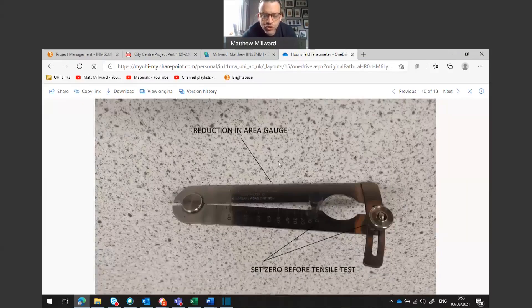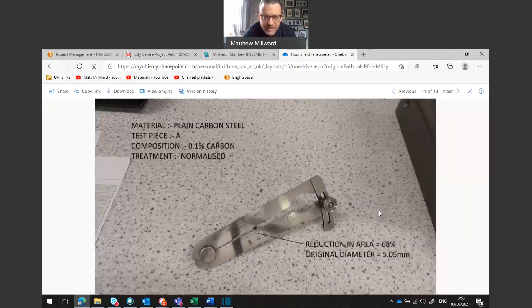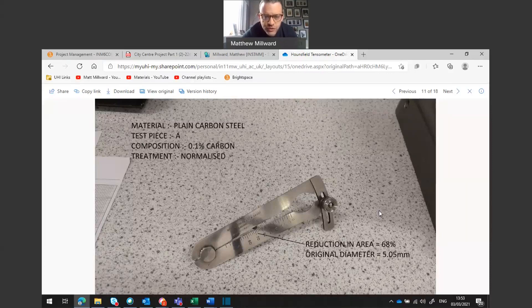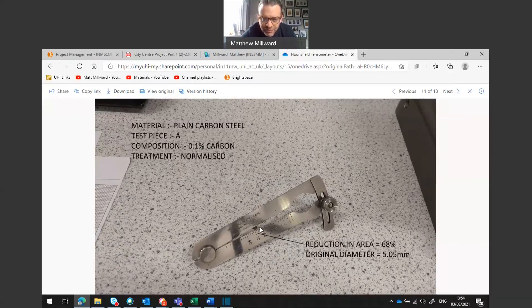Another measurement that has to be taken is the reduction in area gauge. The original sample size is put in and we set that clamp to zero, so the original sample size is set to zero using this clamp. As we stretch the sample, it's going to reduce in area near where the fracture point is. Test sample A has 0.1 percent carbon. When put back into the reduction in area gauge after the sample has been snapped, it is actually around about 68 percent of the original size — so the reduction in area is 68 percent. The original diameter was 5.05 millimeters and it's reduced by 68 percent.